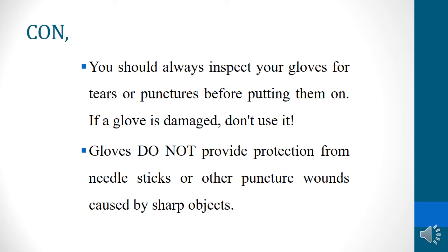You should always inspect your gloves for tears and punctures before putting them on, because if there is damage, it will allow contamination to reach your skin. So if your gloves are damaged, don't use them. Also, gloves don't provide protection from needle stick or other puncture wounds caused by sharp objects. Gloves only protect from blood or body fluid.